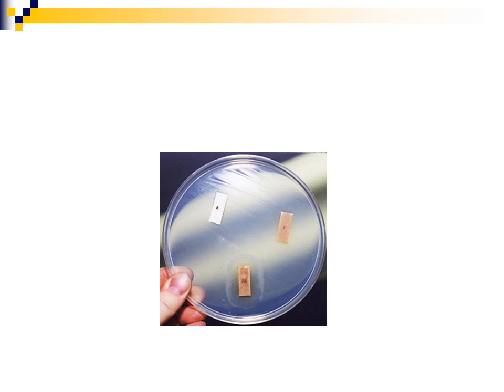These are strips where you have filter paper material that's impregnated with either the V factor or the X factor, or both X and V. You'd make a lawn of your organism and drop your X disc, your V disc, and your X and V disc, and you can see where the organism grows.